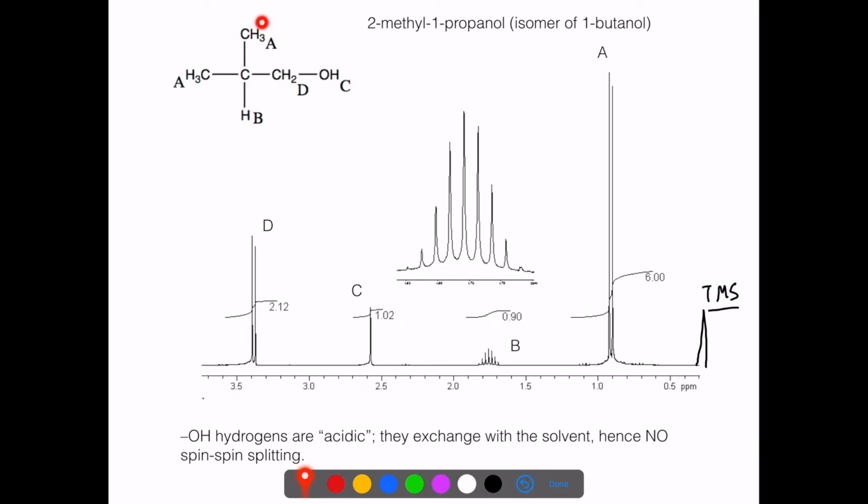So we got that part of it. We get the chemical shift, and then also these 6 hydrogens, 2 sets of methyl groups, are within 3 chemical bonds, 1, 2, 3, of one other hydrogen. They were not quite connected to those 2, so it's 1, 2, 3, just to this one hydrogen, which we've labeled B. So they have one non-equivalent neighbor nearby.